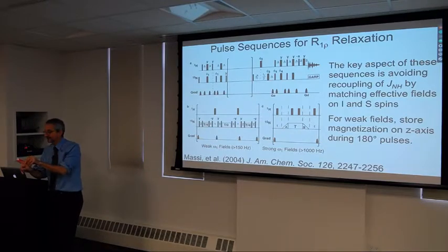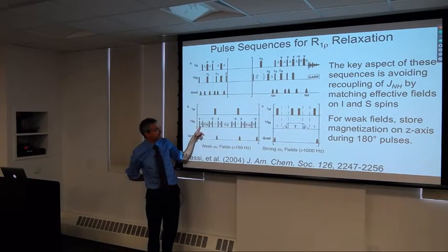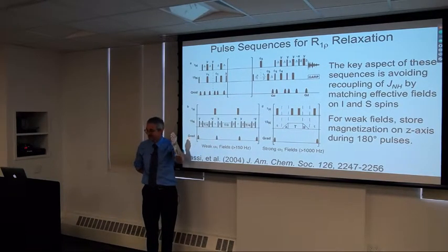And one of the first hints that we didn't do that in some pulse sequence will be that we see a very fast initial decay followed by a slow decay of the magnetization. That very fast initial decay will be the decay due to the B1 inhomogeneity and R2 rho processes until all that's left is the spin lock magnetization. And that's usually a warning. We have to go back and fix the pulse sequence somehow. But there are two strategies. One is to align by a series of pulses and delays to bring the magnetization to approximately the tilted frame.